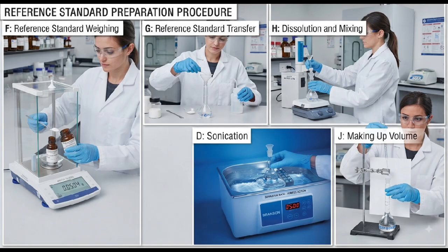Standard preparation. A reference standard or working standard is prepared according to the method. The standard concentration must be accurately calculated because the standard response is used for quantitative determination of the sample.